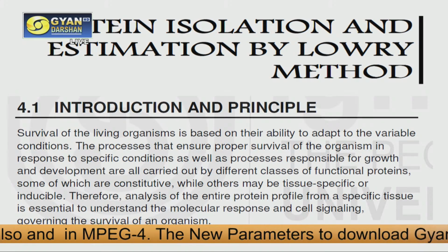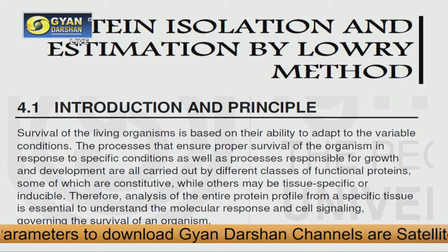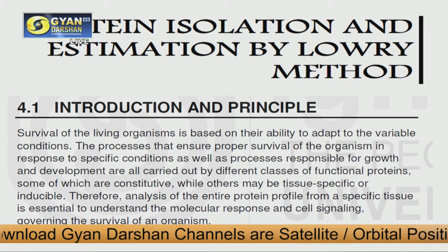So there are several such proteins within the body of an organism, and some of which are expressed continuously and some of which are expressed in response to a particular situation, whether constitutive or inducible, whatever, we need to isolate the protein. We need to isolate the total protein content. So for that we have a protocol. We have, in fact, from what is the source from where you are isolating the protein. That is important.